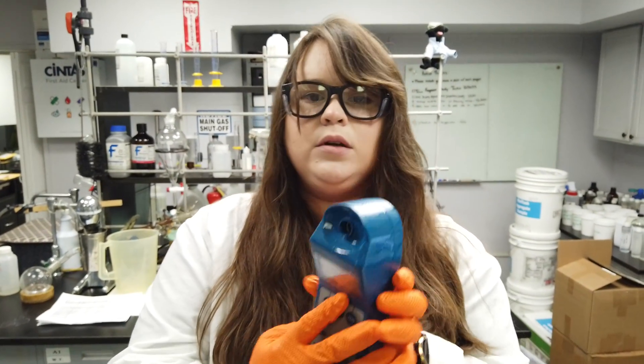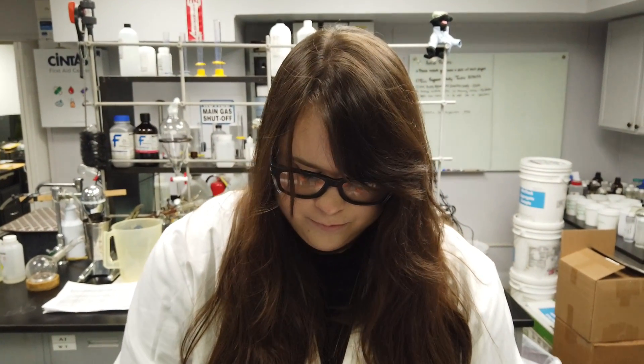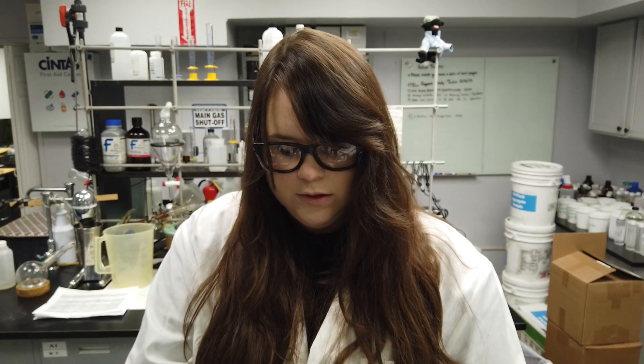For ours, we will be pouring solution into our sample cell to read. I've gone ahead and inserted solution into my sample cell, and I'm going to hit my conductivity button in order to read.